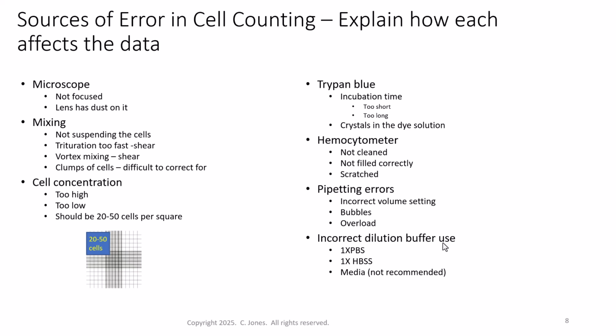Then if we deal with trypan blue, incubation times, if too short, right, non-viable cells, that is dead cells, may not all take up the dye if you don't incubate for at least 2 minutes. But if you wait too long, like 10, 15 minutes, then viable cells, that is live cells, may also take up the dye. As we stated earlier, trypan blue has some solubility issues. There may be crystals in the dye solution that may be miscounted as dead cells. So when possible, we recommend filtering your trypan blue solution right before counting, but that's not always practical. But I get to tell you the best practices, and it's up to you to decide if you want to use those or not.